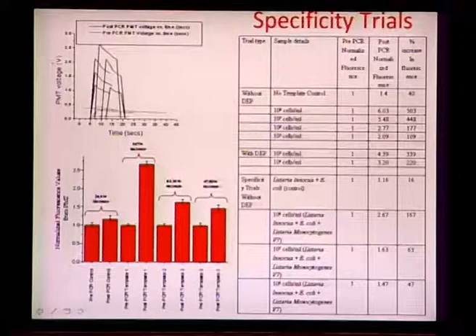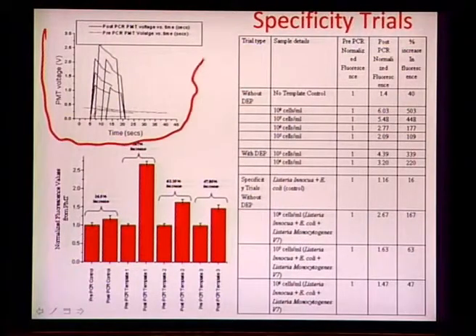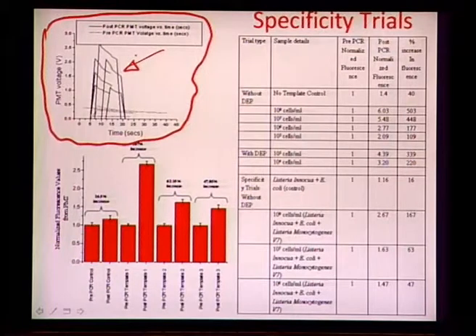The way you take the data is that every time you have completed a fluorescence cycle, you scan the surface over 10 different areas, and these areas do not vary, they remain the same. Then you take this PMT data in terms of PMT voltage by just switching the shutter on and off, so that for a very brief amount of time you get the peak intensity, after which there is a decay in the signal because of overexposure. So, we do not consider the decay part, we consider the highest points to calculate the average and report the average fluorescence value.